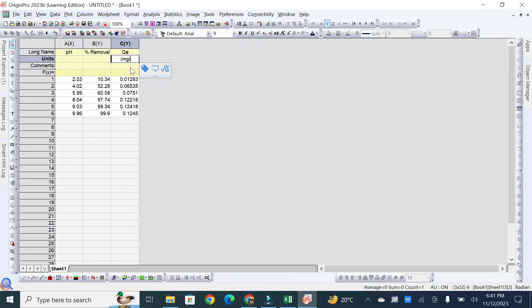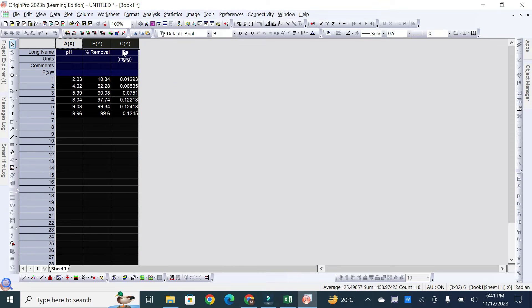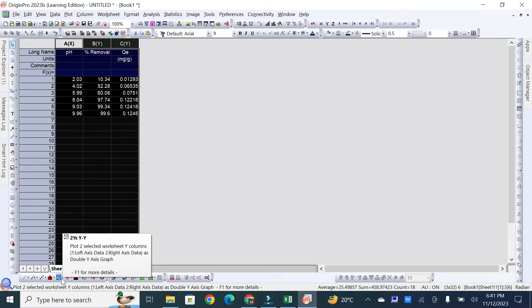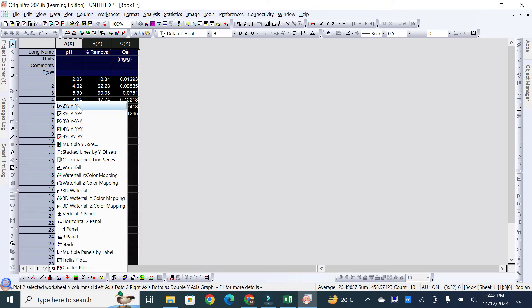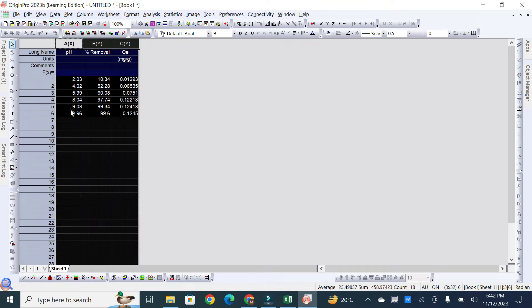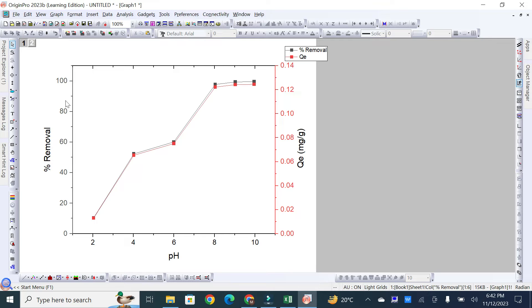Now to plot the two Y-axis graph, first select all the data, then go to the two Y-axis option you can see here. Click on it and select the Y-Y axis plot option. Here you can see that on one Y-axis it shows percentage removal, on the second Y-axis it shows QE in milligram per gram, and on the X-axis you can find the pH of the solution.